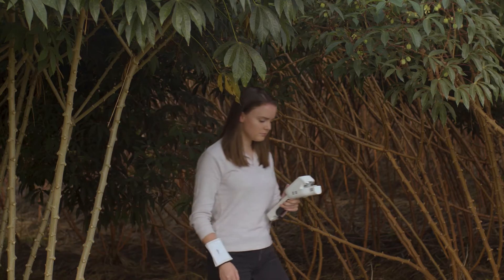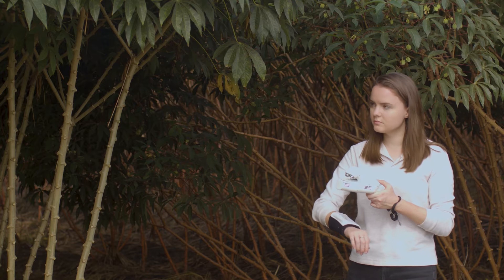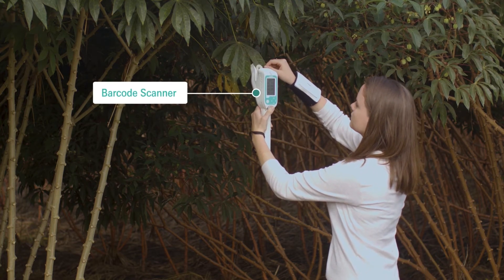Using barcodes? The LI600 has you covered. Keep track of each plant using the built-in barcode scanner. Just scan, measure, and repeat. With the LI600, it's that simple.